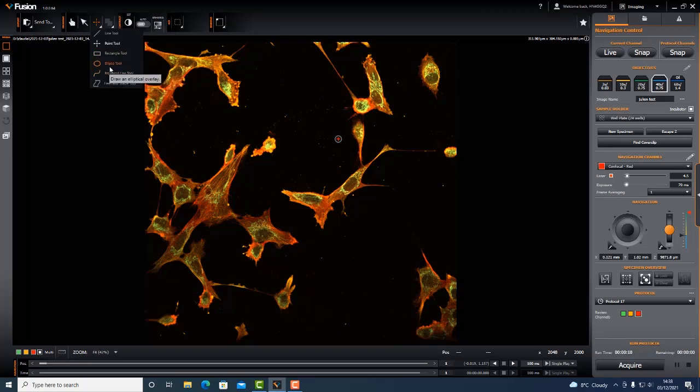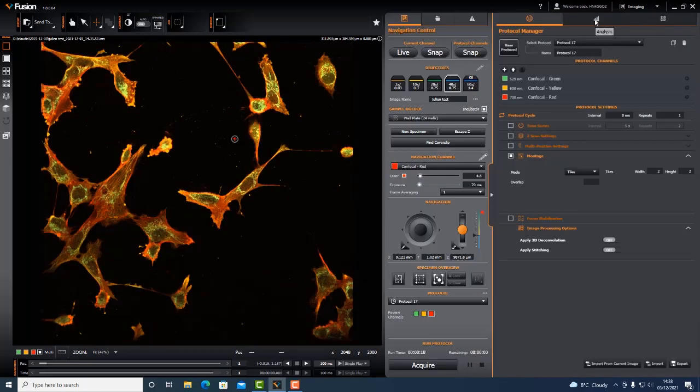I have rectangular tools, elliptical, etc. These are all tools that can be used to register positions that you want to study more closely, to highlight positions, or they can also be used in combination with our analysis tools, which will give you things like pixel intensity counts, and profiles of intensity across areas, for example, across a line tool.